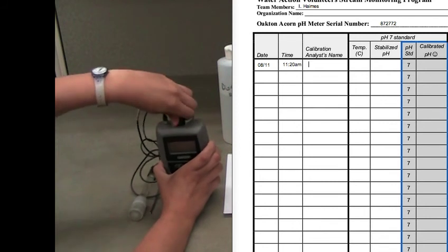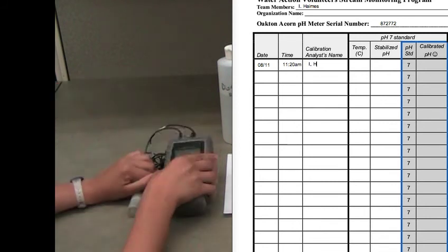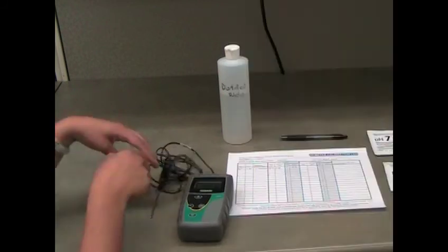Record the date, time, person doing calibration, and the ambient temperature on the calibration datasheet.